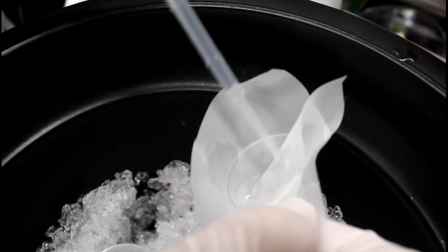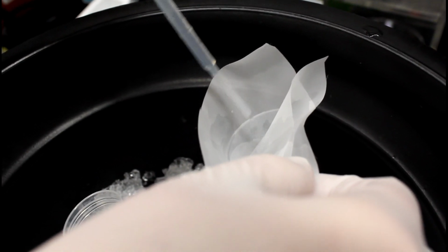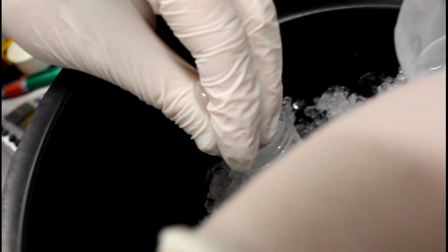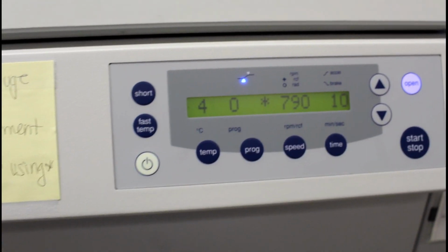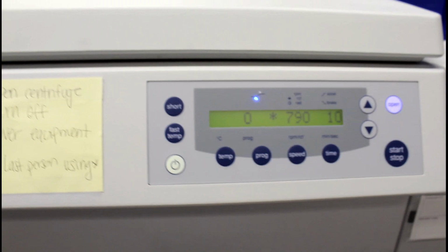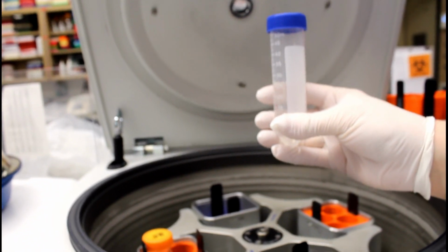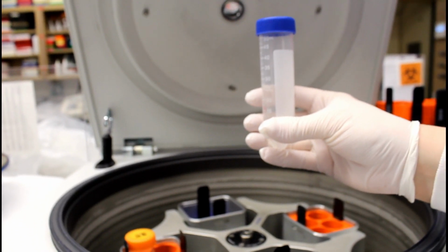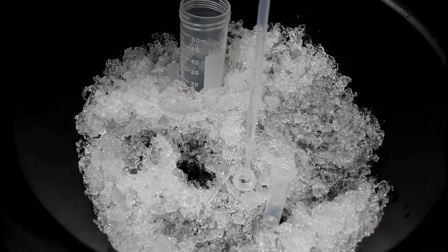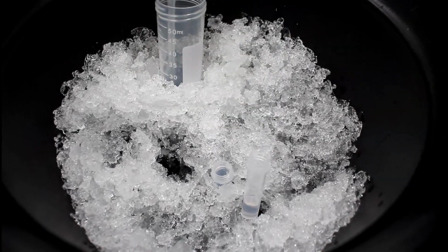Following homogenization, the sample is filtered through a pre-wetted 48 to 53 micron nylon mesh filter into a brand new 50 ml tube. The sample filtrate is spun at 790 G for 10 minutes. Remove and store the entire volume of the DTT containing supernatant at -80 degrees Celsius. Do this in 2 tubes. Remove the entire contents of the supernatant and divide it into 2 equal aliquots. Store at -80 degrees Celsius.